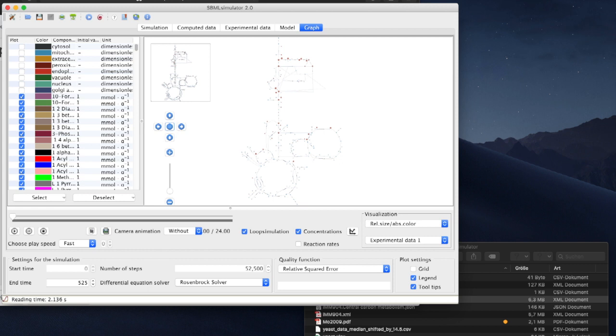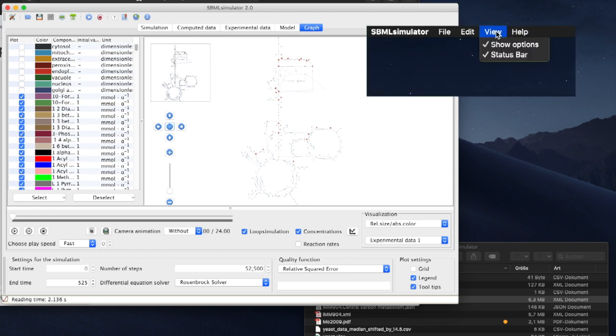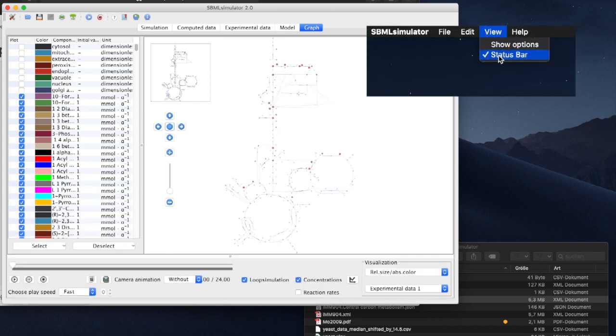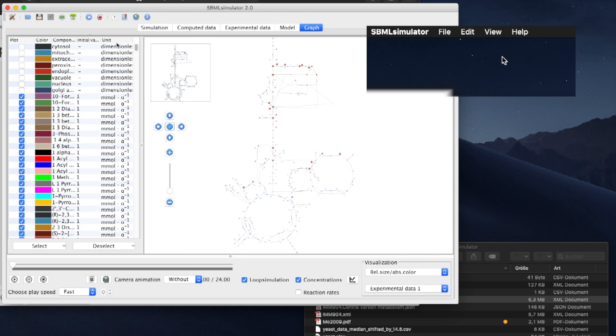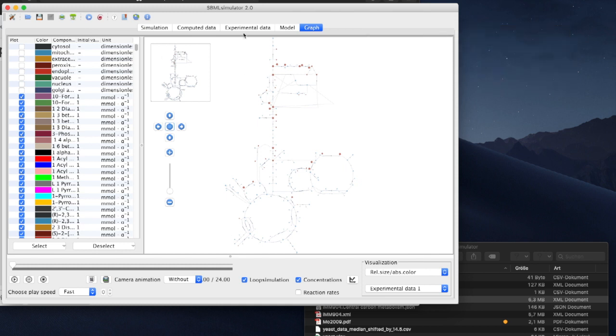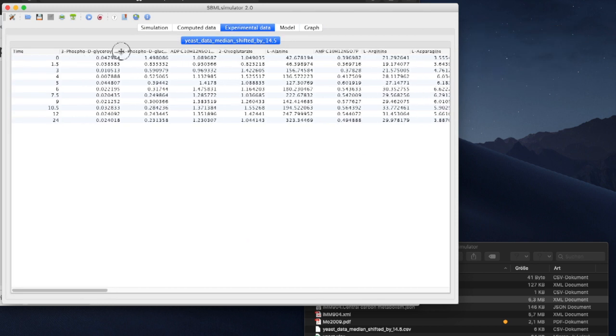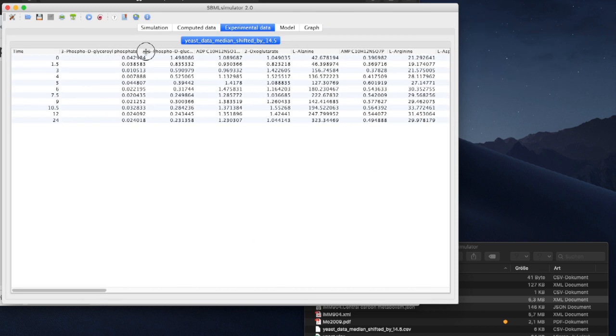Let's switch off the status bar and controls in the View menu, because we don't need them anymore. The tab for experimental data is now enabled, where we can see the same table that we had prepared.